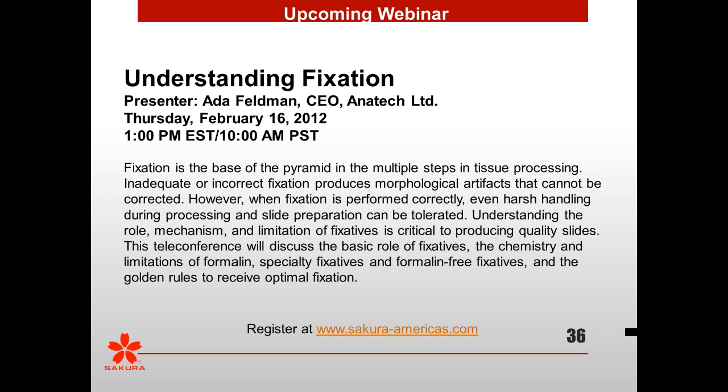Bill, I do have some questions for you, so I'm going to go ahead and get started. One of the questions is pertaining to our grossing tools, and it says, if you purchase these tools and they are still not being used, no PAs or HTs do the grossing at the location. Do you have any suggestions for compliance?